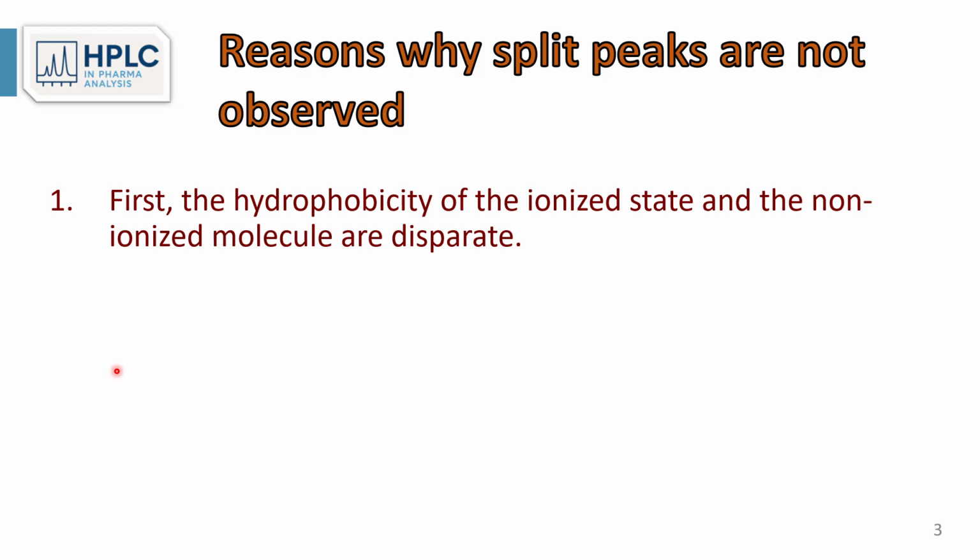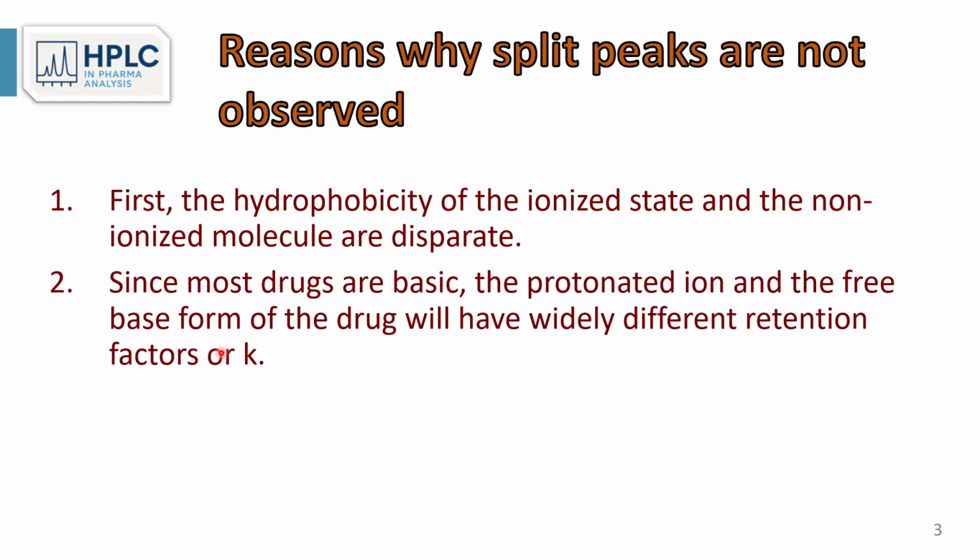First, the hydrophobicity of the ionized state and the non-ionized molecules are disparate because one is an ion, the other is a non-ionized neutral molecule. Since most small molecule drugs are basic, typically the ion is a protonated form, and the free base of the drug will have a very different retention factor, or k.